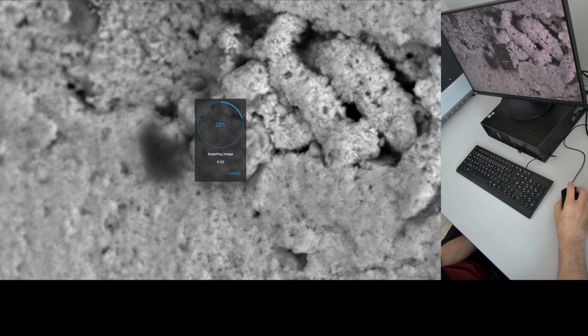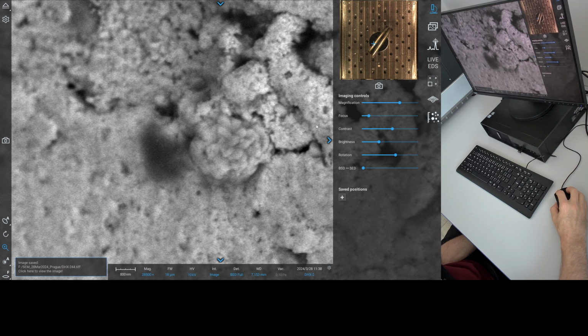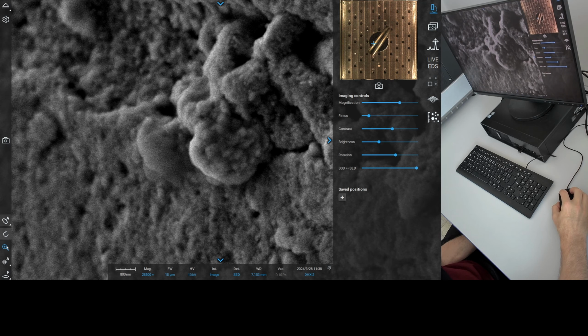Look at this braided pattern here. Okay, I'm really excited to look for more examples of these. Amazing thing. Look at it. It's coming under there, going over there. This is coming under there, braided. It's essentially eating the material, and as it does it, it's spitting it out and just blending it. Oh my God, it's just amazing data. I'm going to put that on SED so we can see the geometry here.